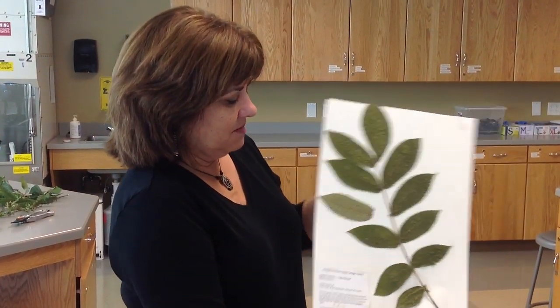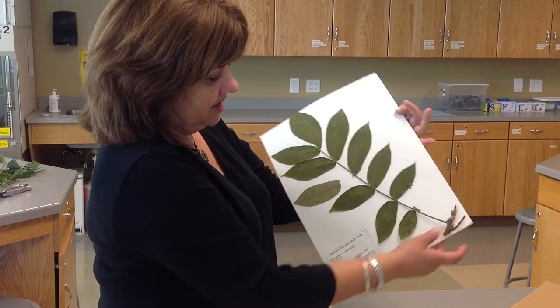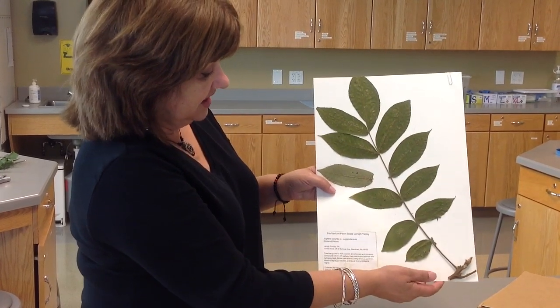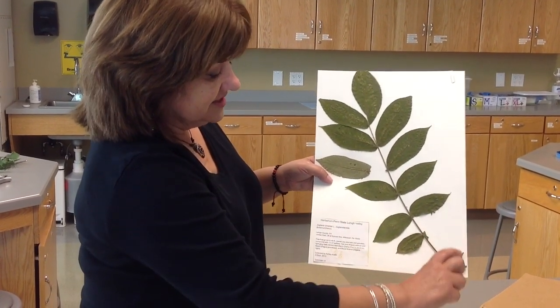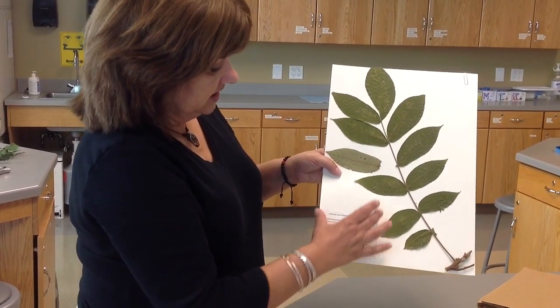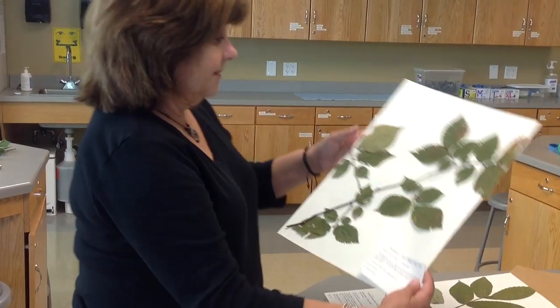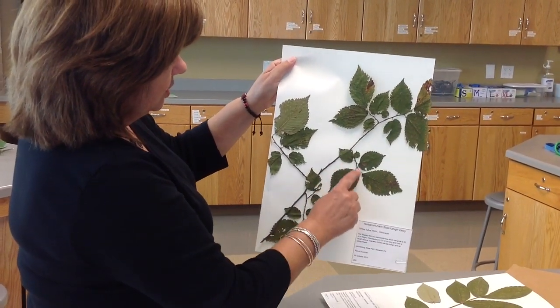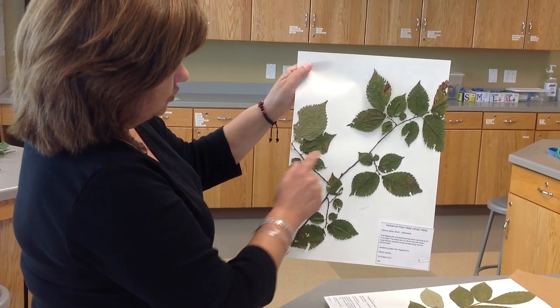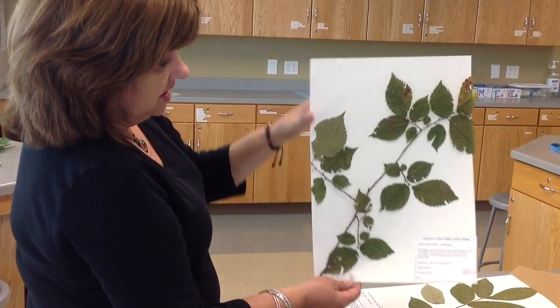What we ultimately want to produce is a product that looks like this, where we have a leaf attached to a portion of the stem — this is the size of the herbarium sheet. This is a plant with a compound leaf, so the leaf takes up nearly the whole paper with a section of stem, leaving room for the label. This other sample has simple leaves, so we don't need as large a sample since we have individual twigs with each leaf.